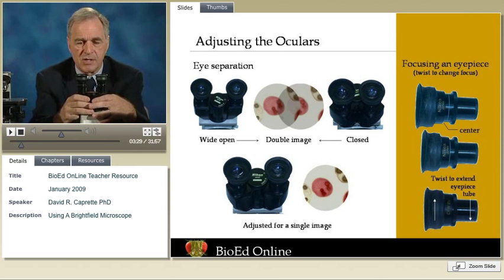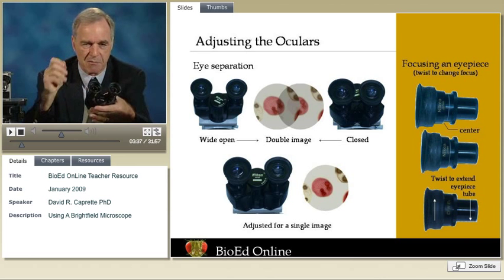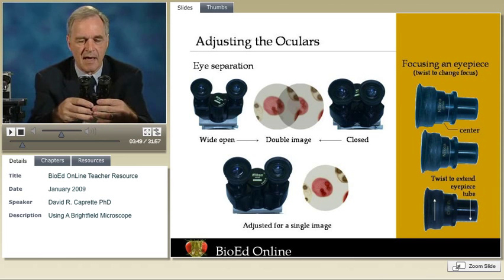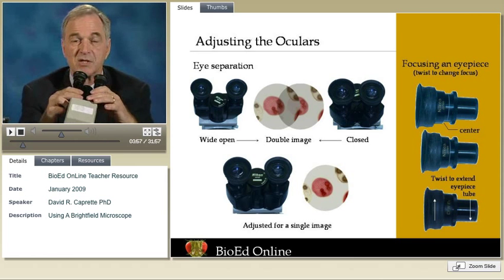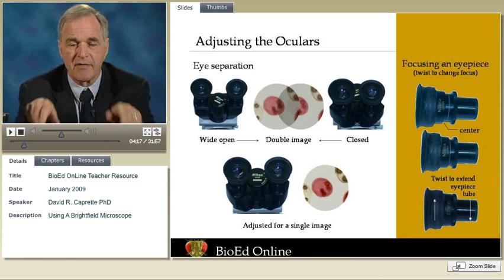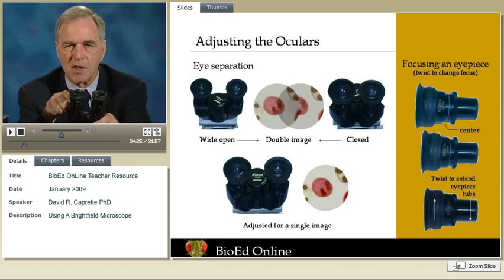If you wear eyeglasses and it's just a simple correction, and you have binocular eyepieces, you don't need to wear them at all. Only for astigmatism or some complex correction do you need them. You can take your eyeglasses off and leave the eye cups in place so your peripheral vision doesn't interfere. The first order of business is to look at the field of view and, just like with binoculars, adjust the eye separation — the separation of the two oculars or eyepieces — so you can see a single field of view with both eyes. People whose eyes are set fairly close together might have a little trouble getting a single field of view, so it's especially important that the individual oculars be adjusted.